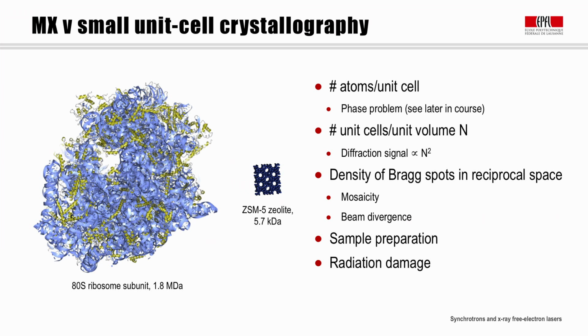The advent of X-FEL radiation and the ability to detect strong signal from crystallites smaller than 1 cubic micron is opening up this field enormously. This too will be described in more detail towards the end of the course.